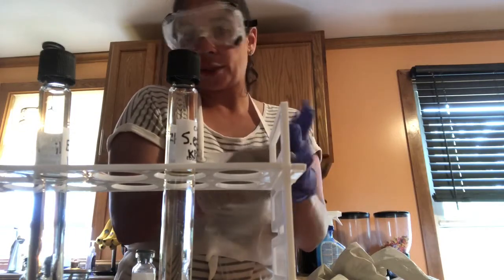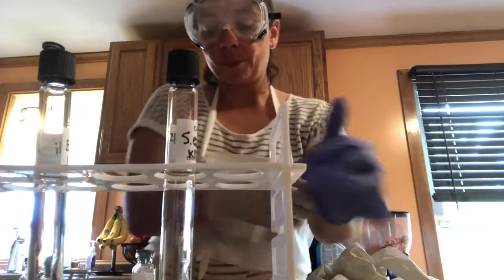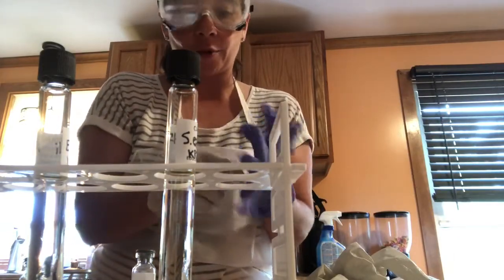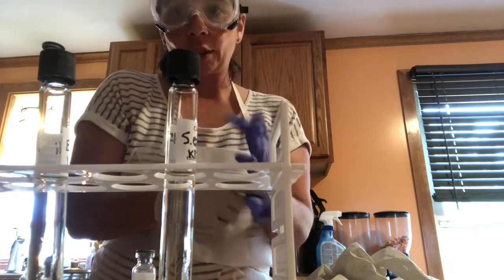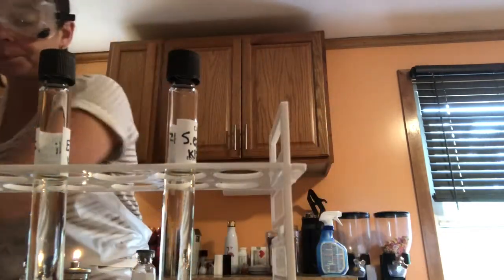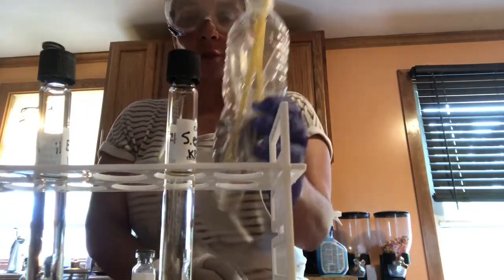Okay, you're going to fill up that transfer pipette, and then you're going to transfer, for about 30 seconds, just gently pipette up and down to mix up all the freeze-dried culture, and then put it right back in the original nutrient broth glass tube, and you're going to leave it for up to 48 hours for it to get cloudy or turbid.